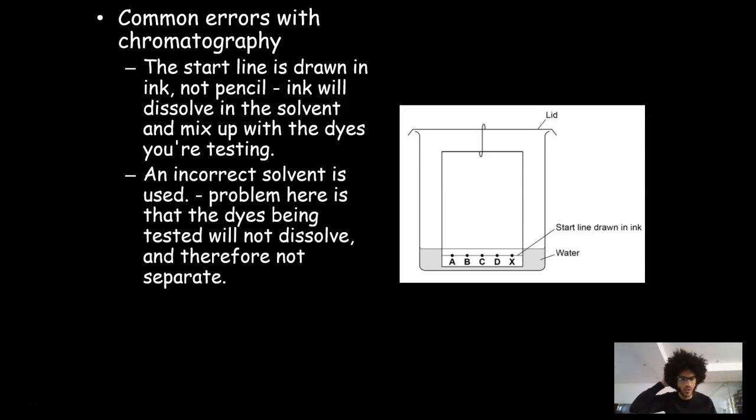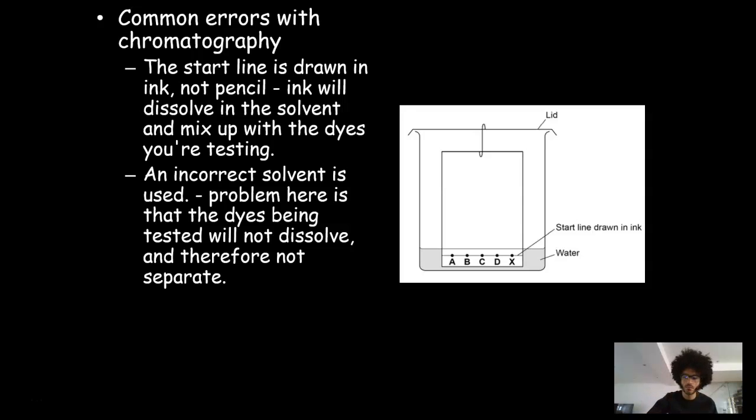Second error is that they used an incorrect solvent. Sometimes this happens. You can see in this particular method, water is used. Sometimes they'll say in the text at the beginning, oh, A, B, C, D, and X are insoluble in water, but they are soluble in ethanol. So you do have to read the information as well as the diagram, just to make sure that you've got that detail absolutely spot on.